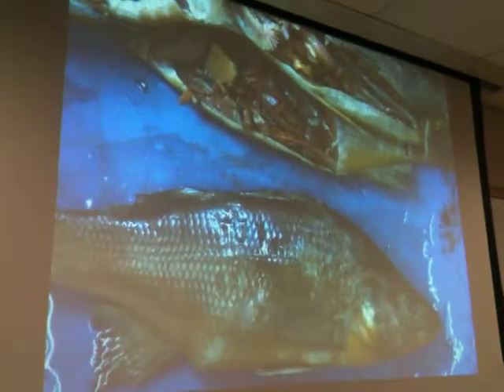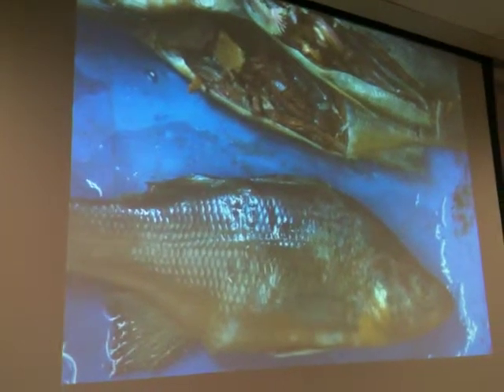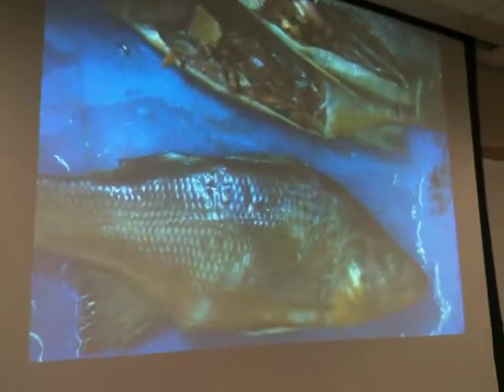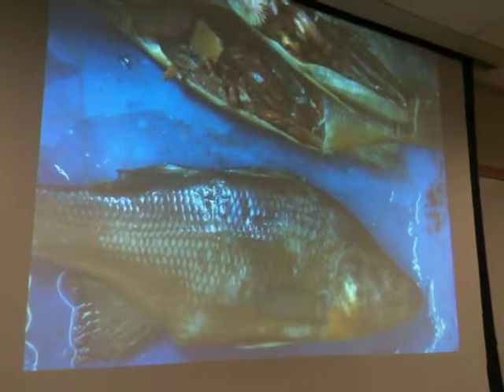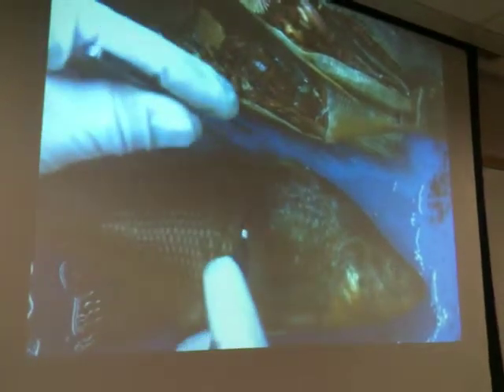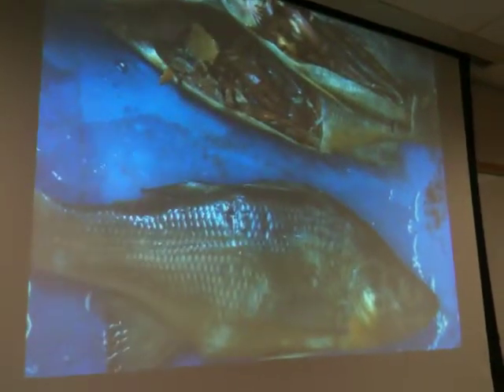Alright, so you need to make sure you know the fins. Like last time, or the last practical, because of that message on Blackboard, the skeletal structures will be on the next practical, okay? So make sure you know the different fins of the fish.